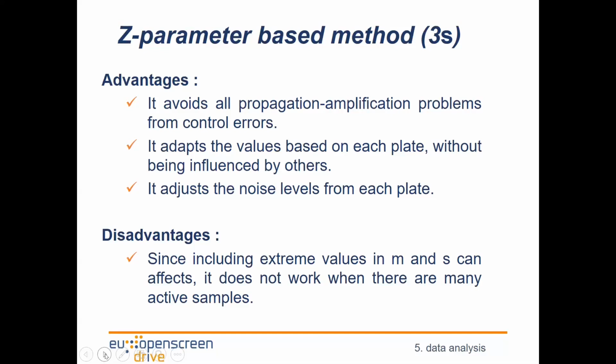And the strength of the plates sometimes gives us problems, like border effects. This border effect is very common in some assays. It could be an issue, because if we have this kind of problem, it means the robustness of our assay is not good, and then we have to evaluate the evaporation effect that we have in the borders. Or maybe we cannot consider the samples that are in the border of the plates, and then we need to avoid this number of wells in the plates.